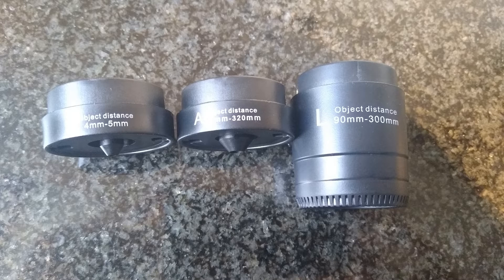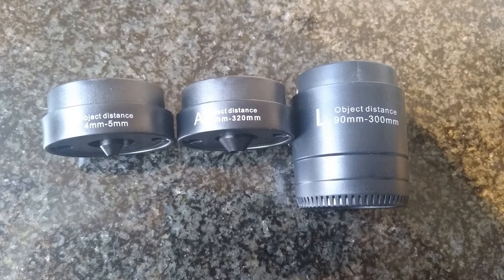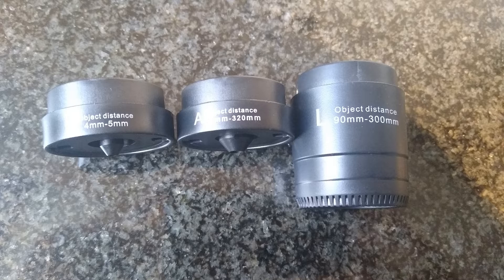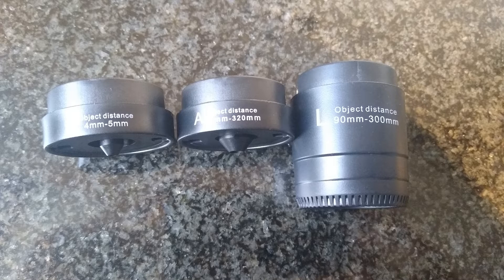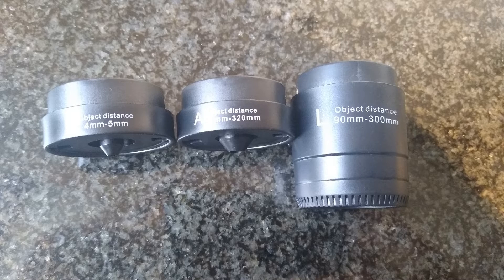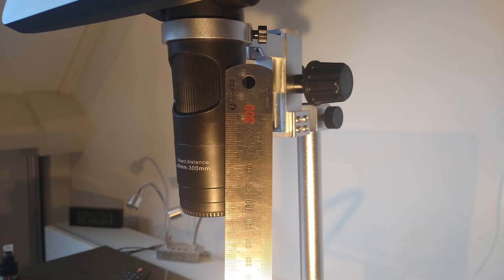The microscope comes with three different lenses. The maximum distance stated on the A and L lens cannot be achieved. The stand is too short for that.